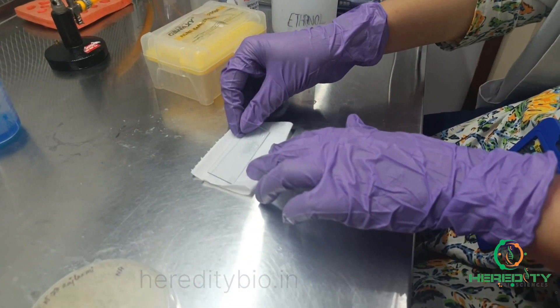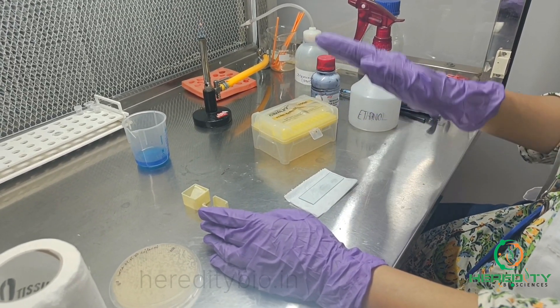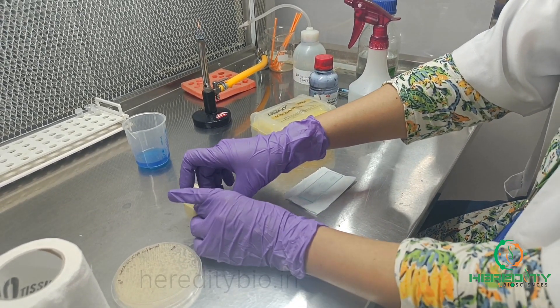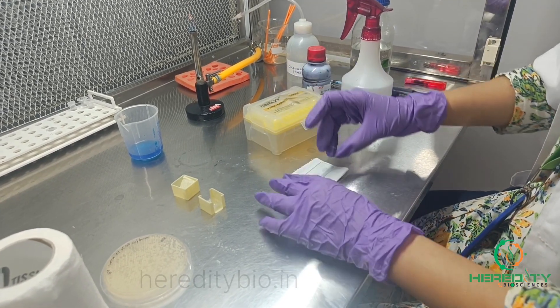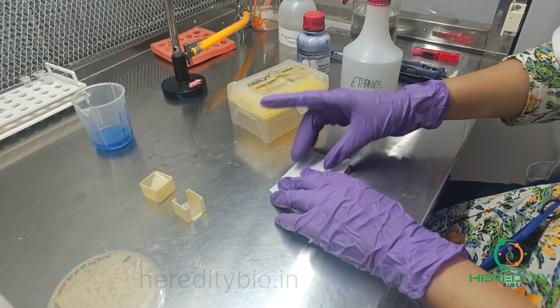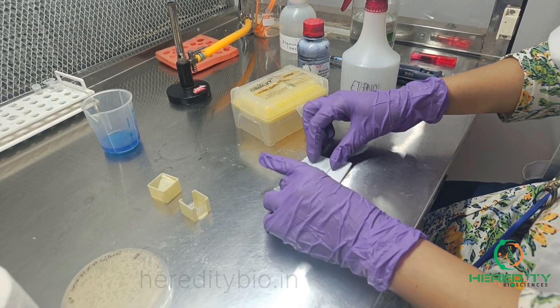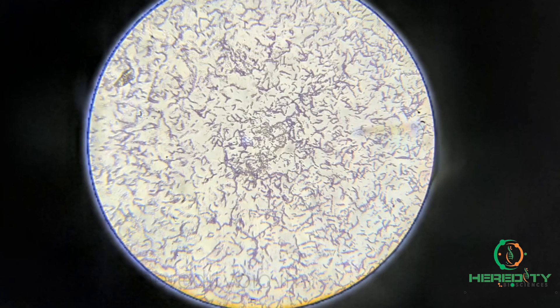Allow it to air dry. After air drying it properly, we'll observe it under the microscope after putting the cover slip. As methylene blue is a blue color stain, we'll observe blue color cells under the microscope.